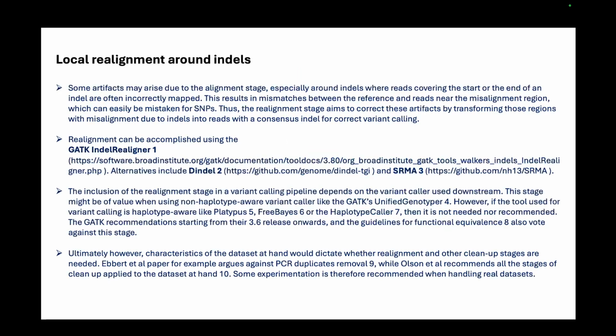Okay, so let's start with local realignment. Why is it necessary, and why do we do it? Some artifacts may arise due to the alignment stage, especially around insertions and small indels. Remember, we are talking about indels.